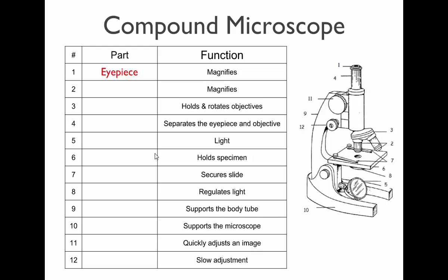And our microscopes have three different ones. We call them low, medium, and high power. We can rotate this round piece to select from one to the other. This round thing we rotate is called the nose piece. Important thing to remember is your lens has to be clicked in. Like when I rotate this, if I looked at it now, I can't see anything because the lens isn't lined up. It'll click into place once it's in the right position.